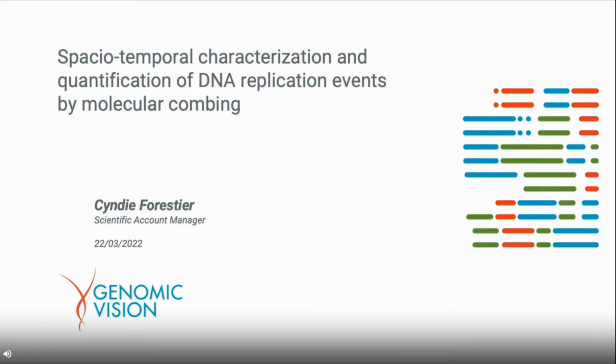Today, I am going to present how molecular combing technology with Genomic Vision Replication Combing Assay, RCA, enables spatio-temporal characterization and quantification of DNA replication events for a better understanding of replication kinetics.